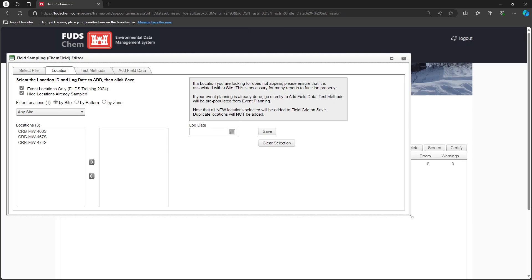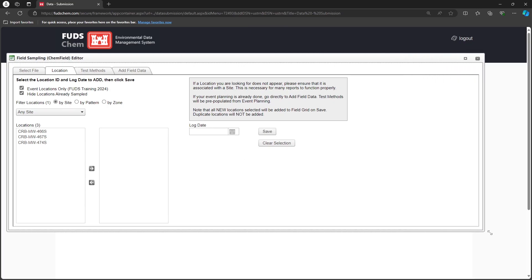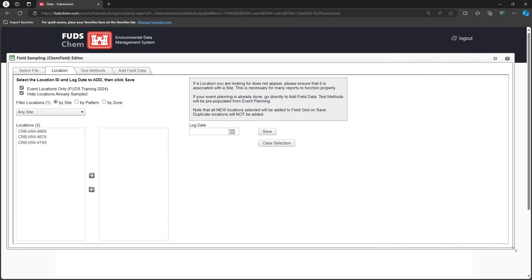As a best practice, we recommend creating one CHEM field file per CoC. Doing so keeps the data organized, prevents interface slowdown, and makes it easier to back out data for editing if needed. If you have multiple CoCs, start by creating a CHEM field file for the first one, then create a new file for the next one.